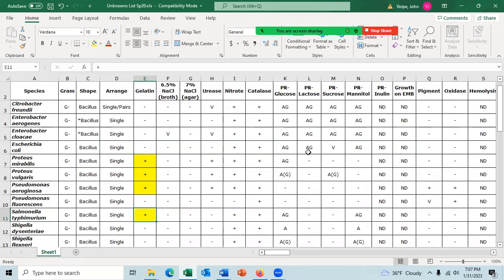Any questions about that? I guess I should go gram stain. That's not exactly how you're doing it. You're going to do the gelatin hydrolysis test first, and then the gram stain second, I think. But it still results in the same four species. Any questions about that?